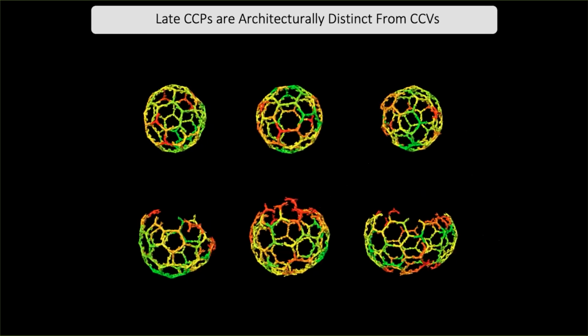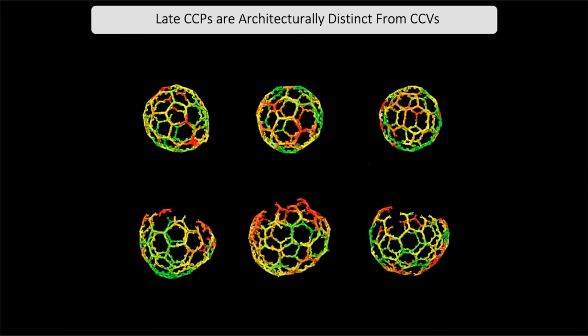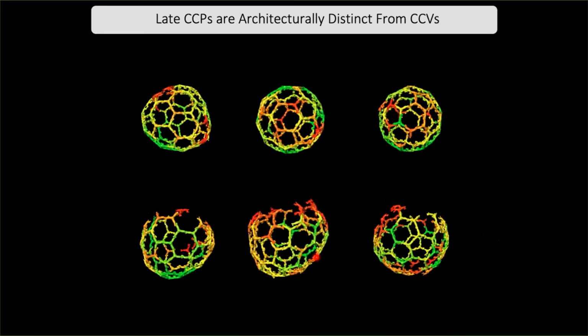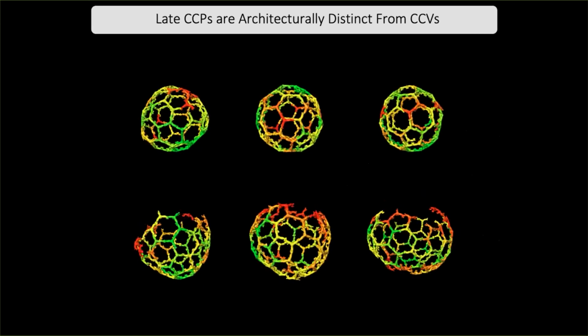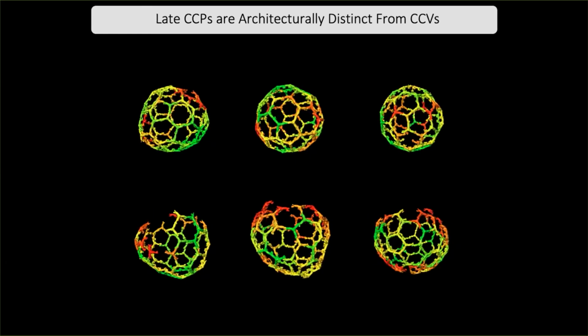One way to do that is to now have good structural representations of the intermediates. And by having both the final objects and now all the intermediates along the way, which you can also bin according to different fluorescent signals, it in a way becomes only a question of time and effort, and not a question of whether we are able or unable to do it.